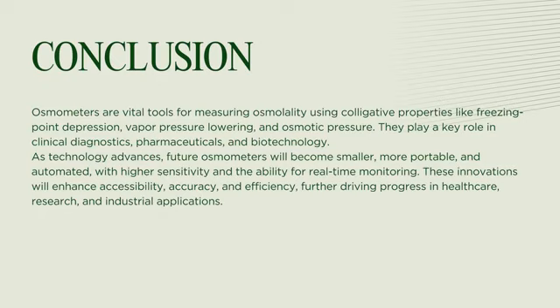As technology advances, osmometers are poised for significant innovation. The future will bring smaller, more portable devices, increased automation, higher sensitivity, and the potential for real-time continuous monitoring. These improvements will make osmometers even more accessible, efficient, and precise, opening new possibilities in diagnostics, research, and quality control across industries. By keeping pace with these advancements, the field of osmometry will continue to provide valuable insights into the molecular composition of solutions, supporting progress in healthcare, pharmaceuticals, and scientific research.